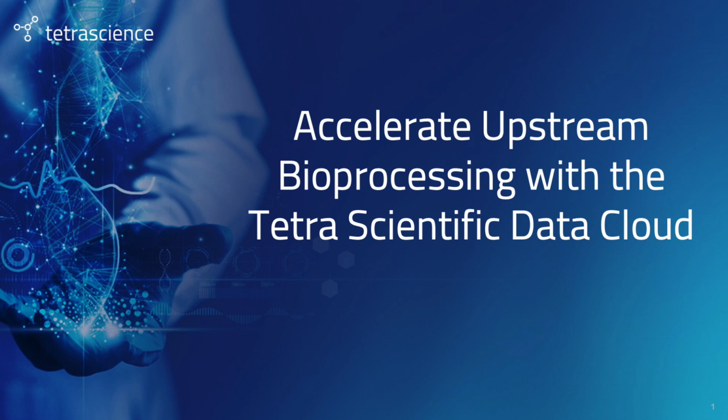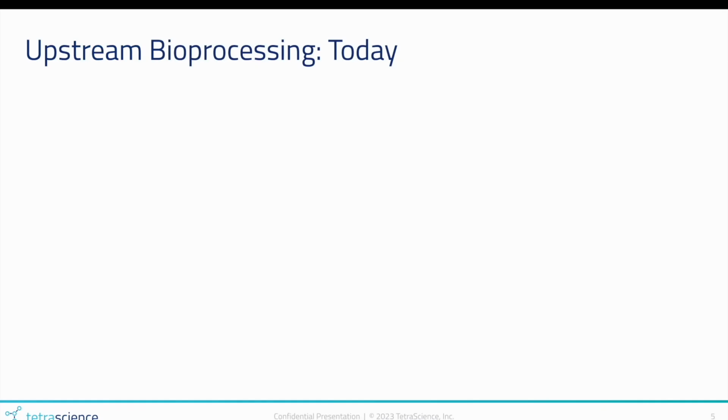Today I'm going to talk about how we can accelerate upstream bioprocessing with the Scientific Data Cloud. Let's take a look at a typical upstream bioprocessing workflow, where the goal is to maximize production of a target protein, such as an antibody, from an engineered cell line.